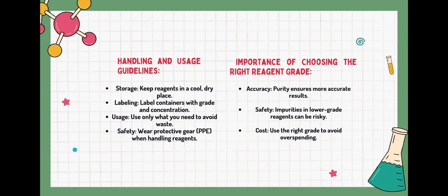Handling and usage guidelines. Storage: keep reagents in a cool, dry place. Labeling: label the container with grade and concentration. Usage: use only what you need to avoid waste. Safety: wear protective gear (PPE) when handling reagents.